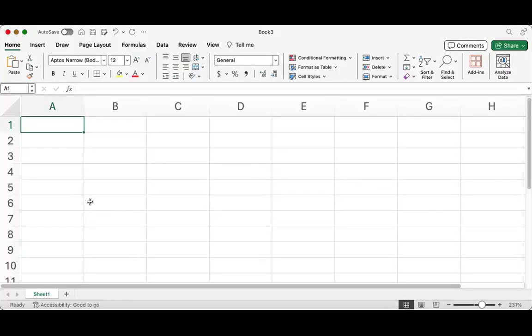So I'm going to do this as if I was doing a different experiment, where I am doing a calibration curve of the concentration of lead. So I'm doing the concentration of lead, in brackets, and I've recorded the absorbance.